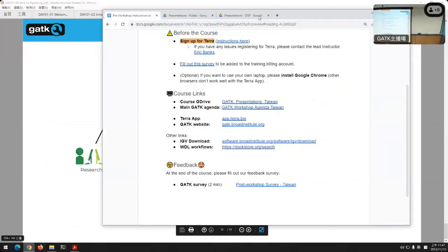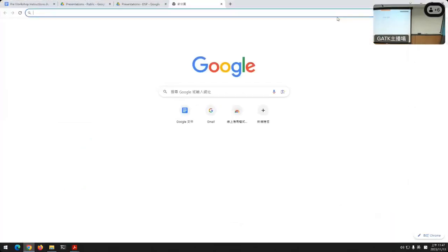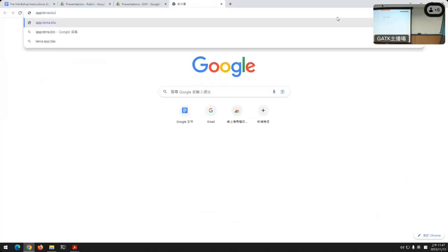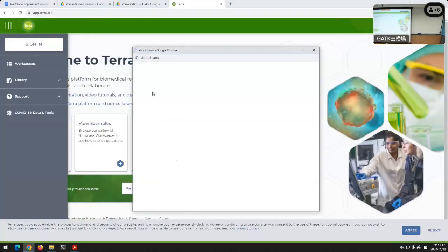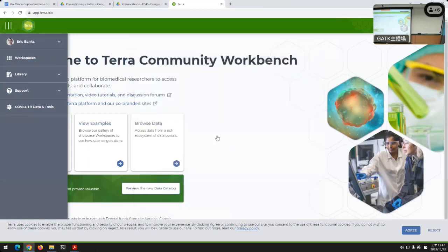Go to, yeah. Oh, this here, it's not handle and it's just a lot. And I'm signed on as just Eric, thanks.